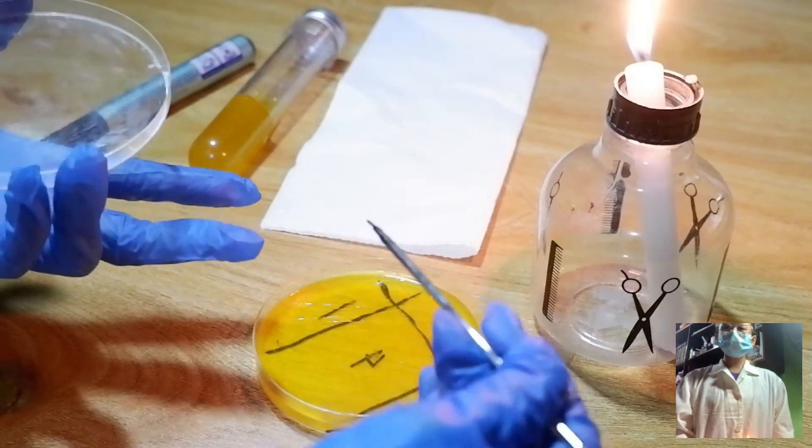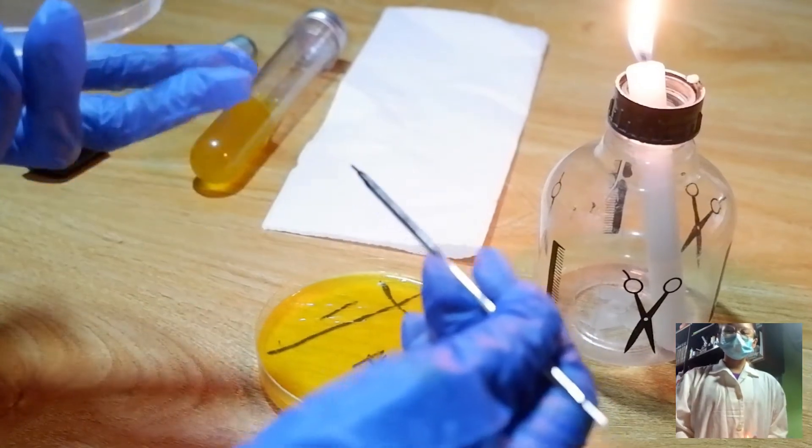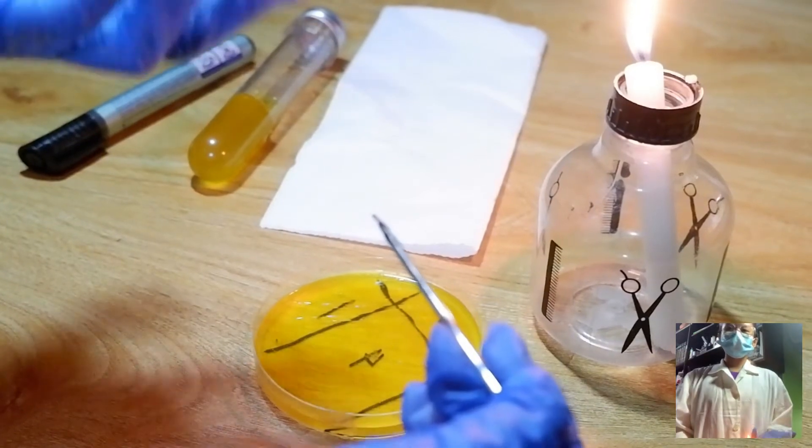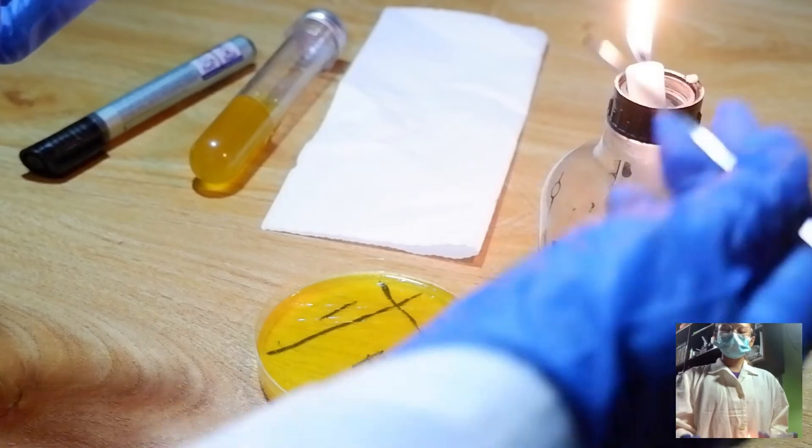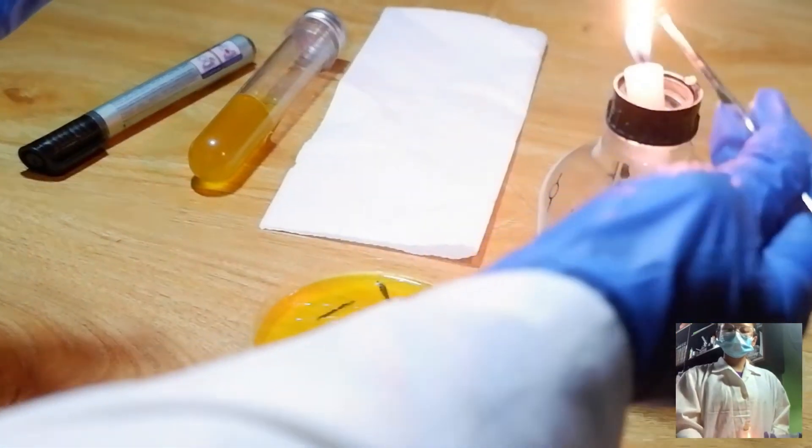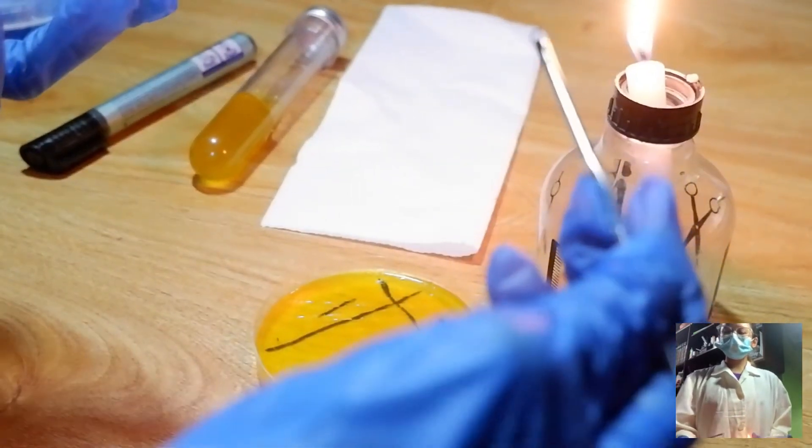We have to avoid digging into it, so just apply it lightly to our agar medium. Then, we will have to sterilize the loop again and let it cool down for 5 to 10 seconds.